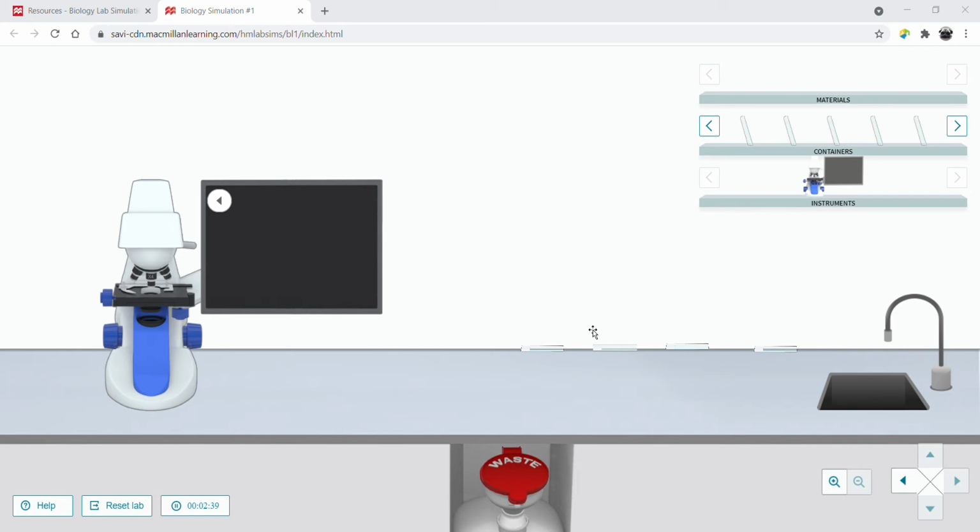But they are combined with what we call objective lenses that are further down on the microscope, on that revolving nose piece. Usually there are 3 or 4 on a good microscope, and they in and of themselves have magnifications. When combined with the eyepiece magnification of 10, that gives you a larger magnification.